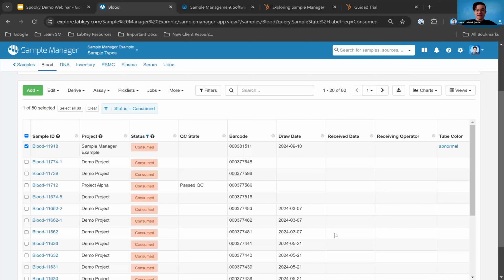Are there tools to assist in the design and registration of a particular experimental sample? Let's see, I'm just reading it, so it's a longer one. Yeah, so there's different things that we can do depending on what it is that you're needing. That actually might be more of our LIMS question. So we also have LabKey LIMS that focuses more on the automation of it, whereas Sample Manager is more for those basic experiments, but that's a great question.